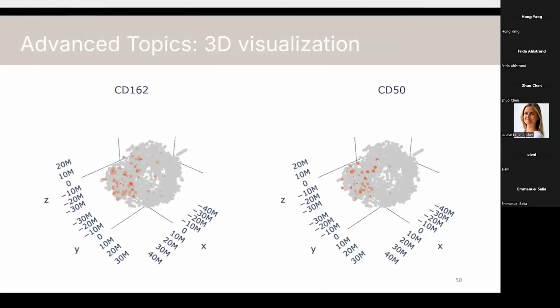And then we usually end the analysis pipeline by visualizing cells. Once again, working with graph data, we can leverage this to form these beautiful visualizations of every single cell in our data.